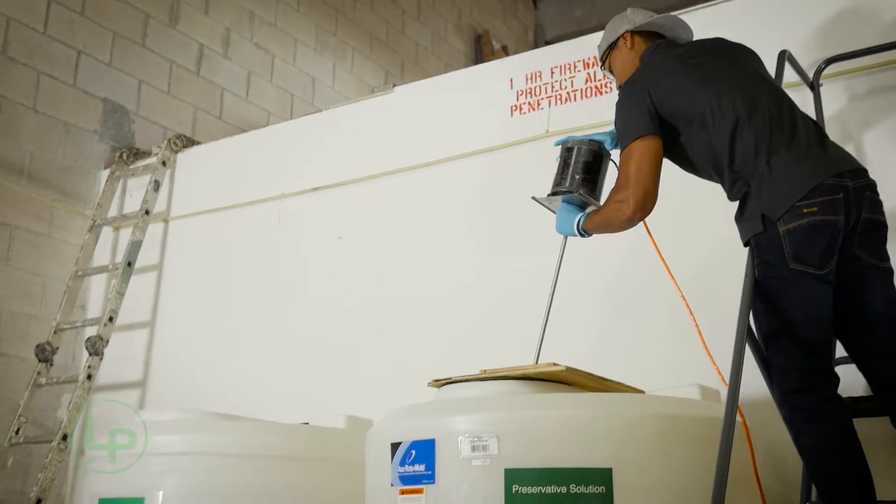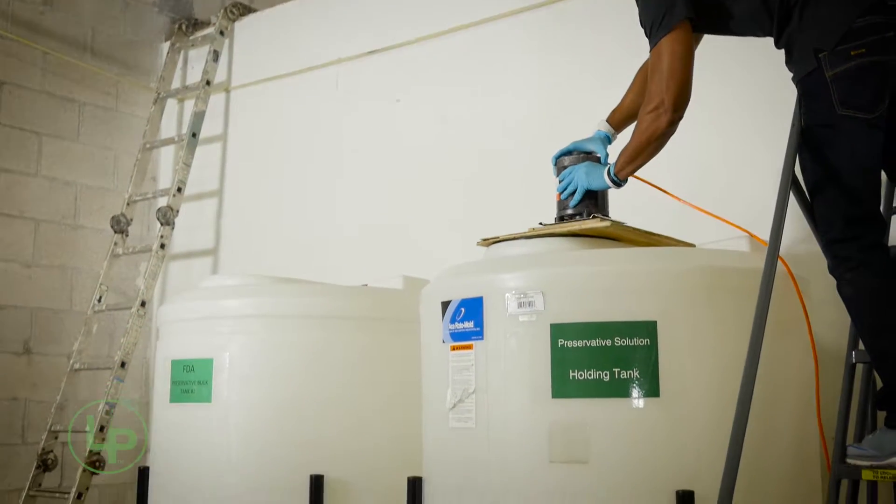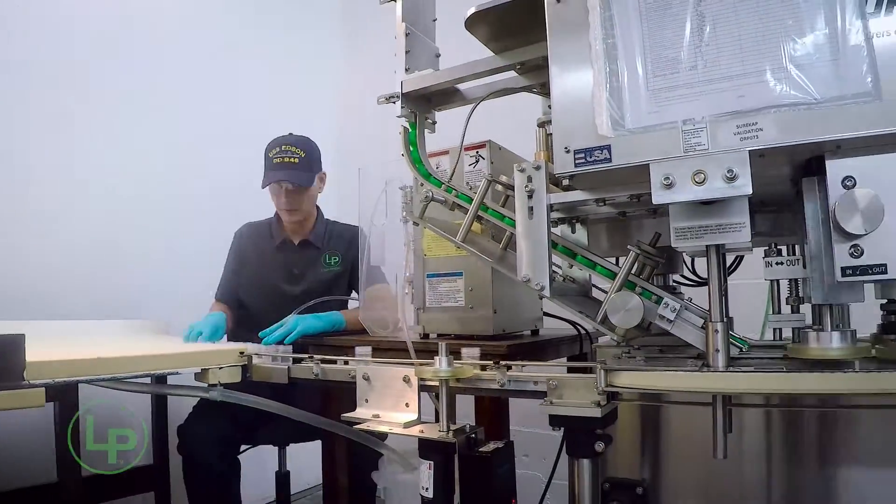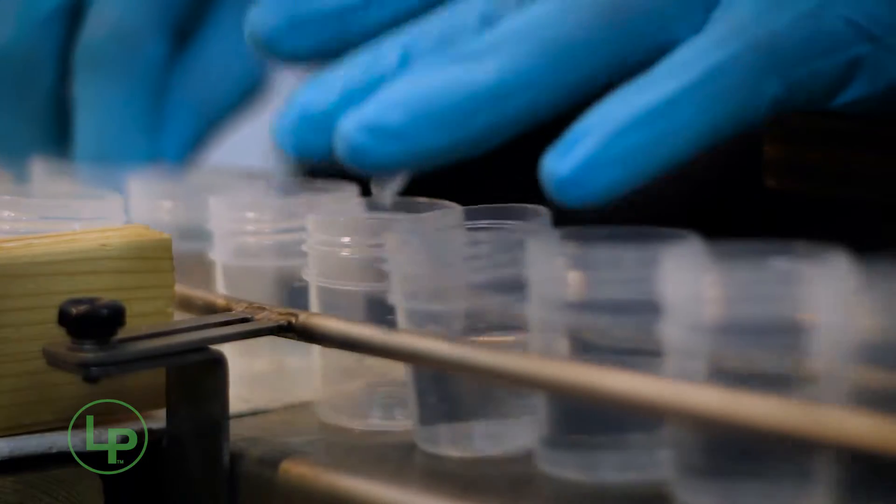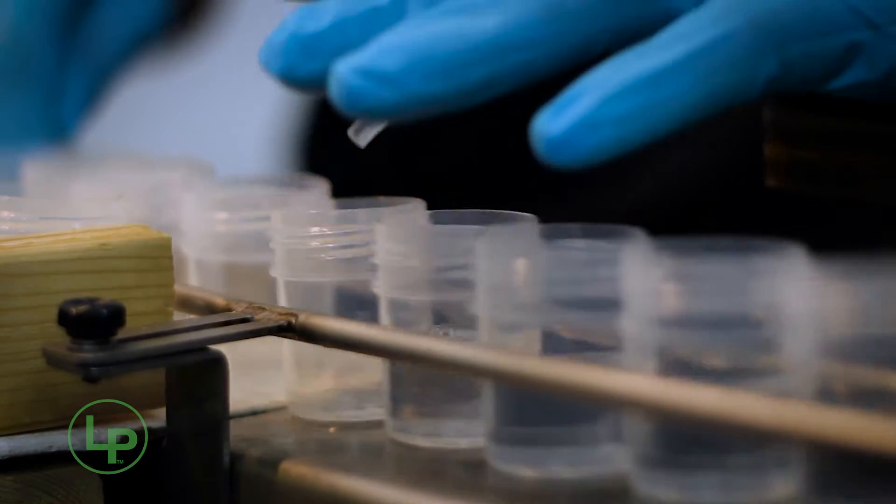All LiquiPrep reagents are formulated in our facility. LiquiPrep reagents are all registered with the FDA. Thanks to automation, 4 million LiquiPrep preservative vials can be produced per year.